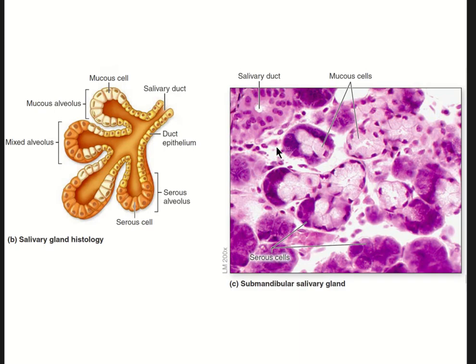Okay, so here's another nice close-up. As you can see here, you can clearly see in the serous cells a very dark nucleus, and the serous cells are also staining a little bit darker, whereas the mucus cells stain a little bit whiter because of that thick, lubricating mucus that they produce. And here is our circular ring of duct cells, right? Very clear, simple cuboidal around a circle.